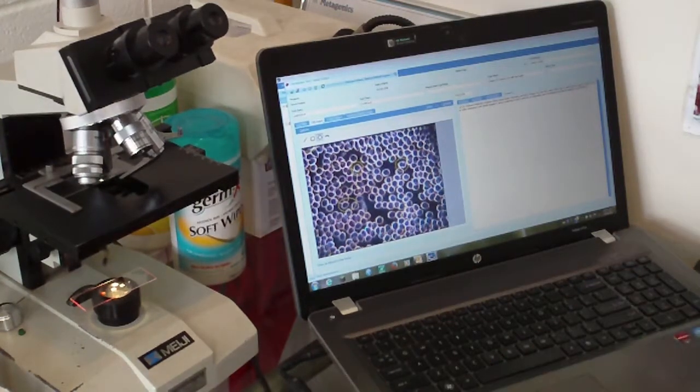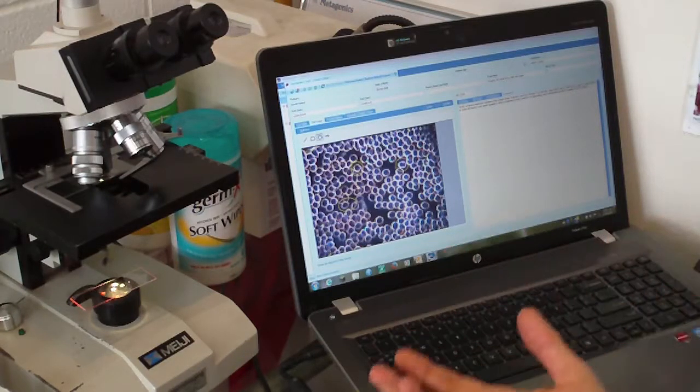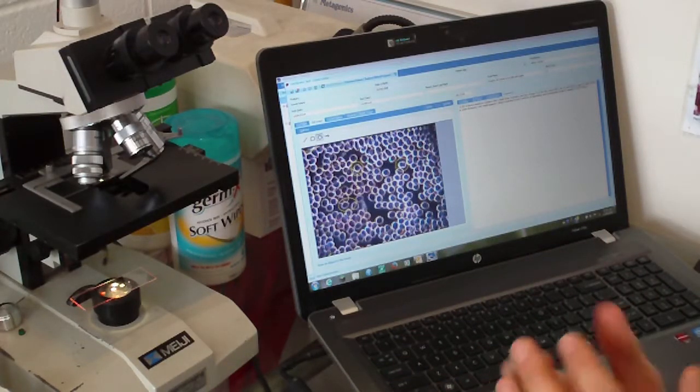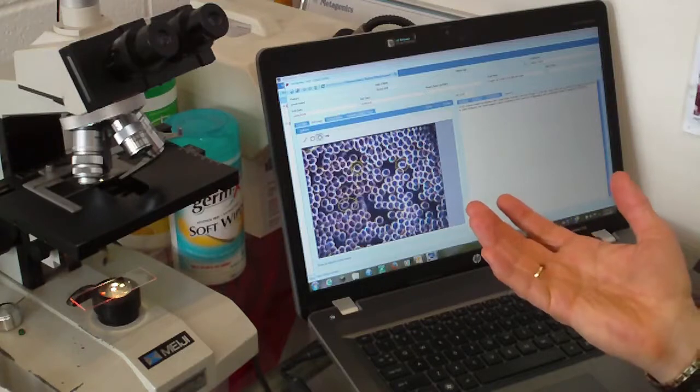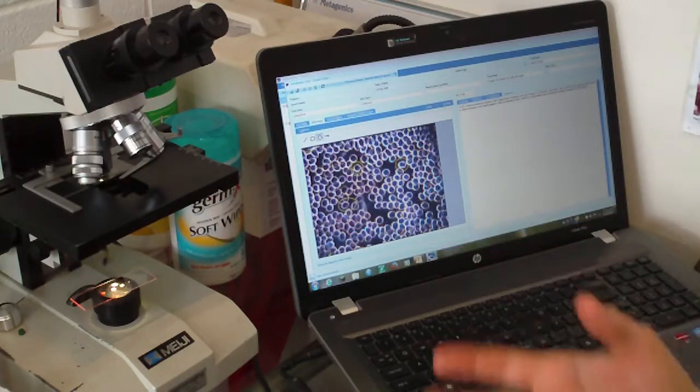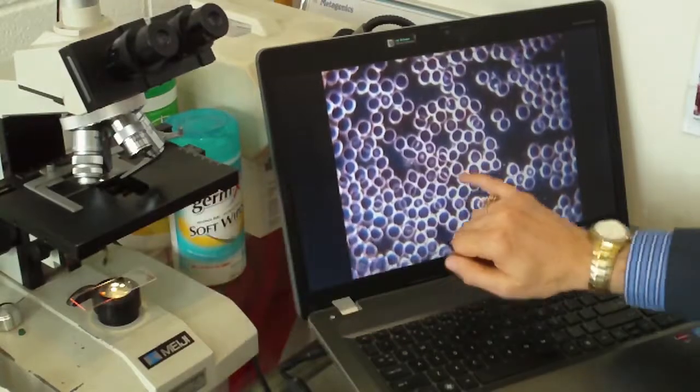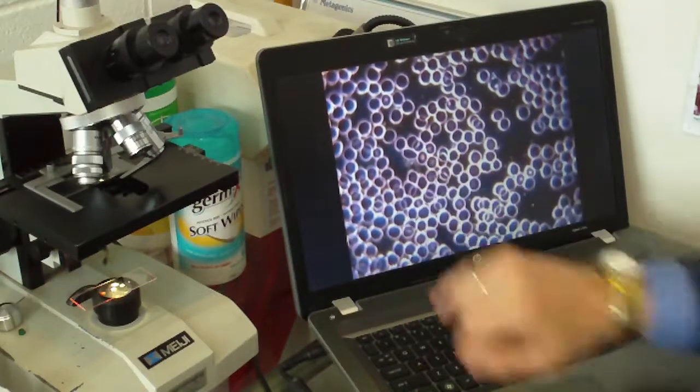So what's happening is the patient's doing a detox. Chemicals are coming out of the stored fat in the body, the liver, the spleen particularly, and possibly the kidneys. And so the body needs to up its level of antioxidants to protect healthy cells from those toxins as they're drawn out. Now, here's another sign. This elliptoid pencil cell.